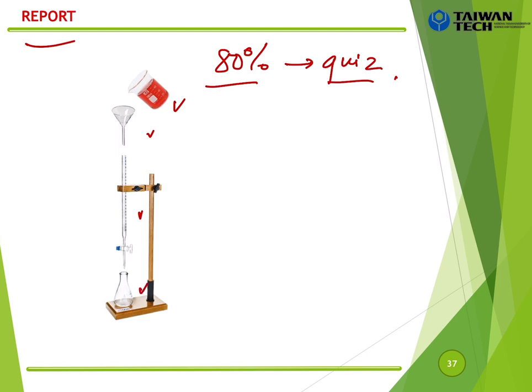You should, because you already checked my video or maybe my material, and you know the purpose of each equipment, right? And for the purpose of each equipment, you can see we can make a combination, right? Like for the beaker, you keep the solution and then you can pour the solution into the burette. But before it comes to the burette, you can put the funnel, okay? And you let the solution go easier, and then it can come to the burette.